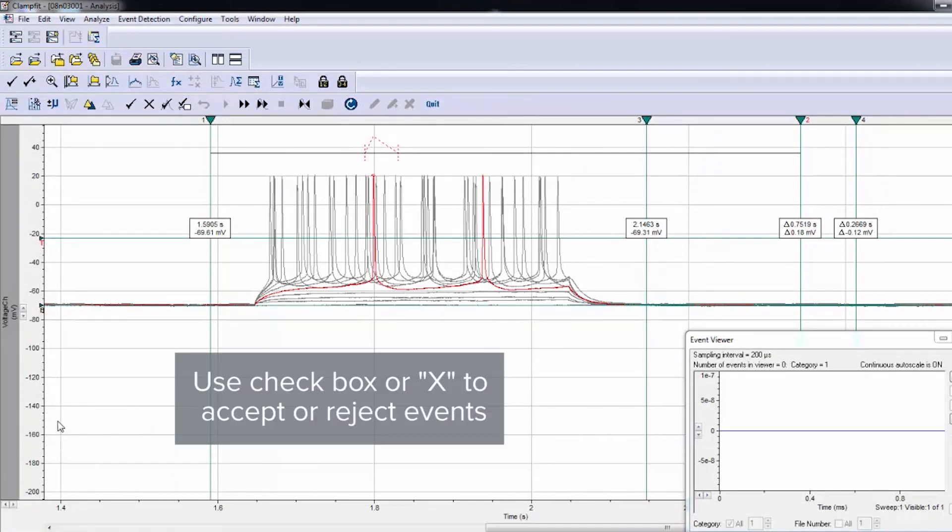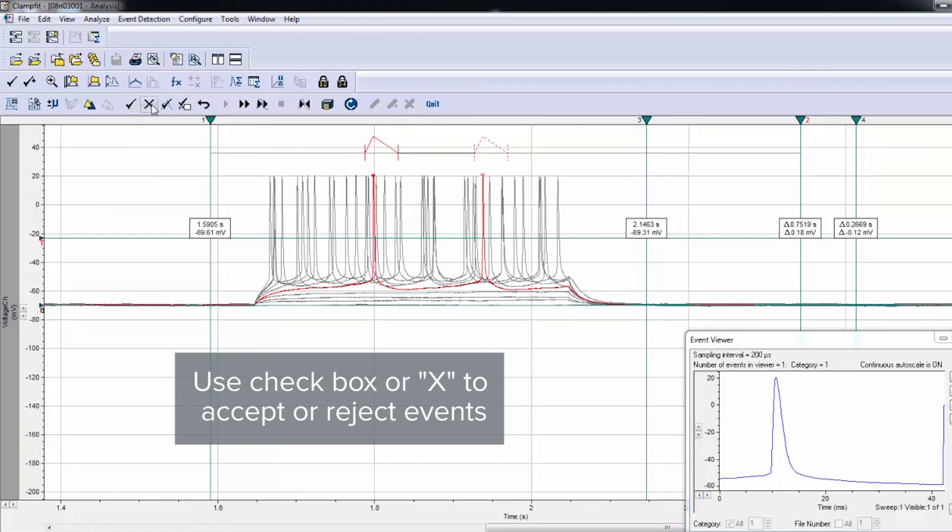You can click the checkmark to accept an event, click X to reject an event, or select Non-Stop Search.